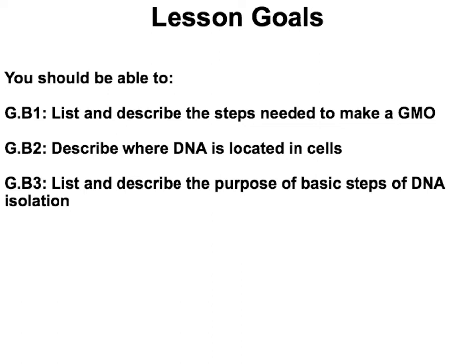Today we're going to do the second activity of our genetics unit, and it's really cool because we're going to be isolating our own DNA. And isolating DNA is one step in the making of a genetically modified organism, or GMO.